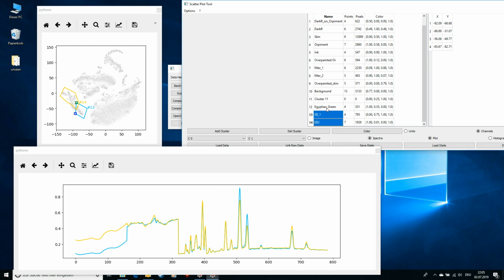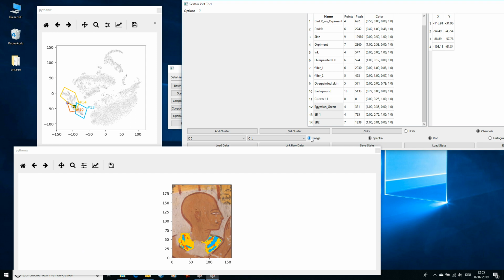Also, we have the Egyptian green, which also has a strong copper signal, but here we have a slightly different shade up here, which is not really characteristic for Egyptian green, but it lets us believe that it was there also from the context and other objects. We're having here also a little bit of the Egyptian blue shape in it, because it's round and partly shared between pixels, as the resolution is not perfect in this data. And that's what you can find back in this dataset, and I wish you good luck with it, and have fun.